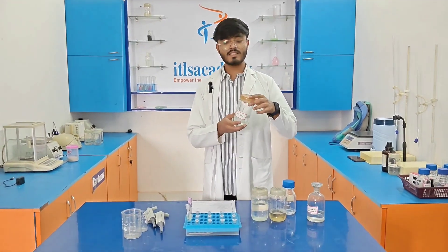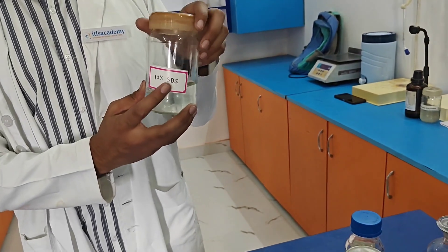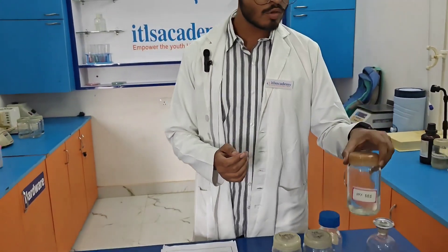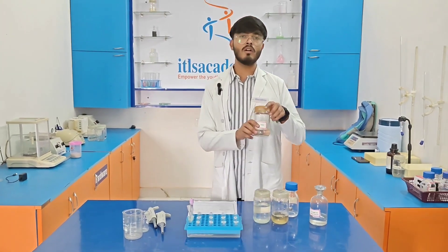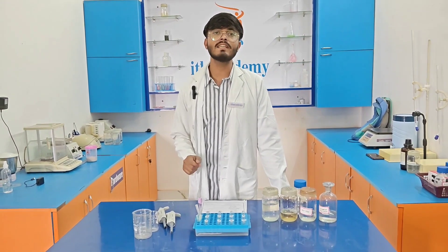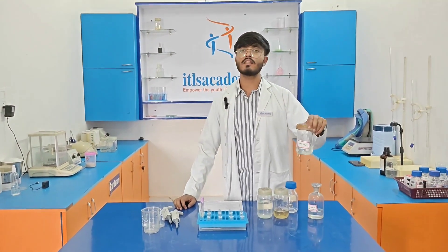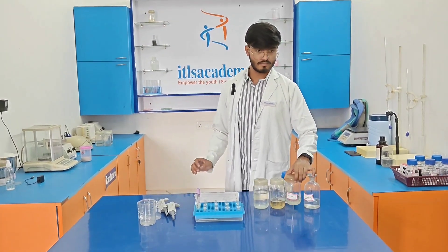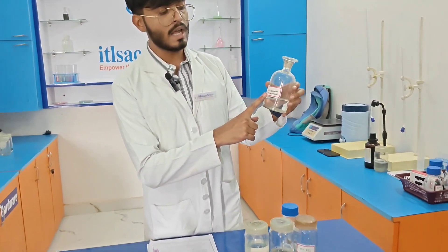The next solution required is 10% SDS. SDS is basically sodium dodecyl sulfate. We prepare it by dissolving 10 grams of SDS in 100 ml of distilled water.